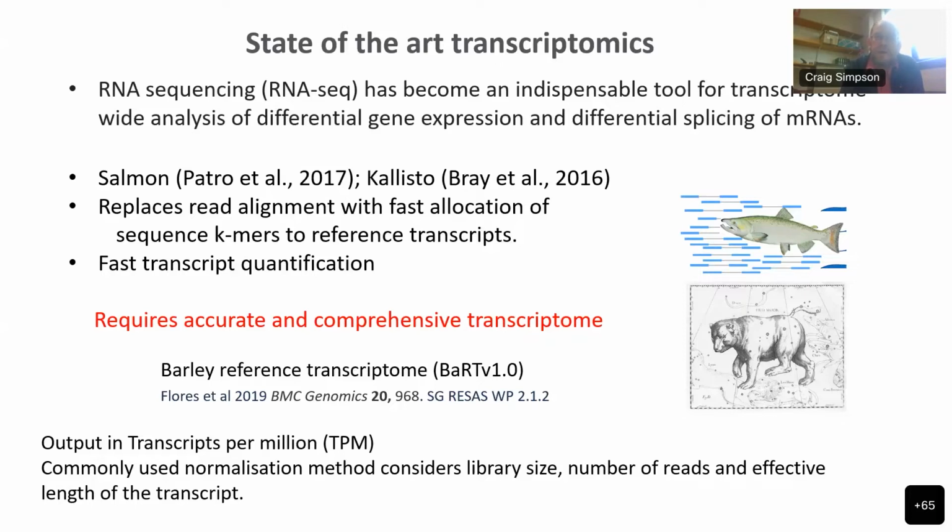So a lot of our work in plants has been built up from a couple of people here at Hutton. Runjuan Zhang and Wenbing Guo had set an RTD, a reference transcript data set, up in Arabidopsis. And we wanted to follow that in barley so that we could quantify RNA-seq data very quickly as well. So our first go at that is what we call BaRTv1. It's Barley Reference Transcripts, is what it means. And that was done by Paula Flores and Misha Bayer here at Hutton, and got that set up in 2019.